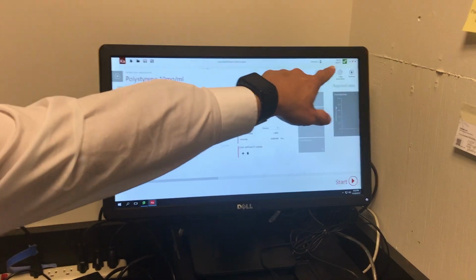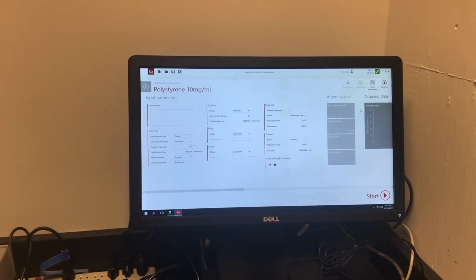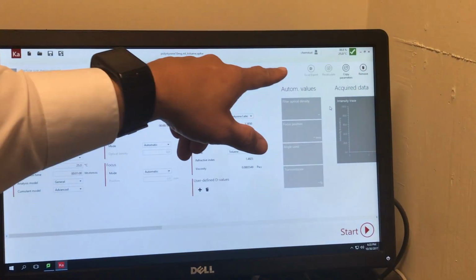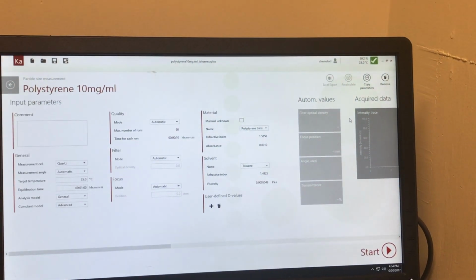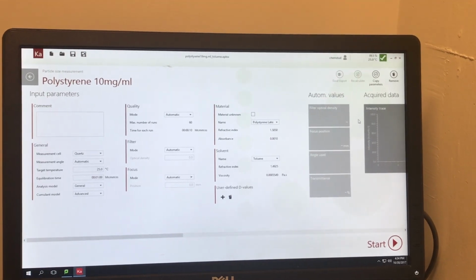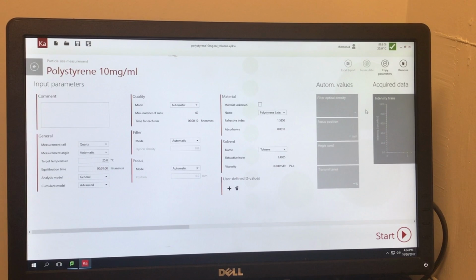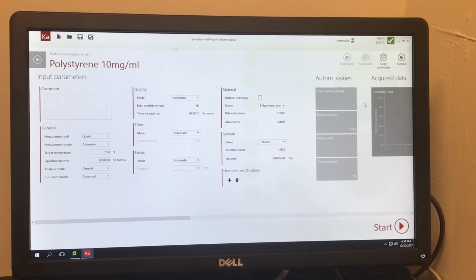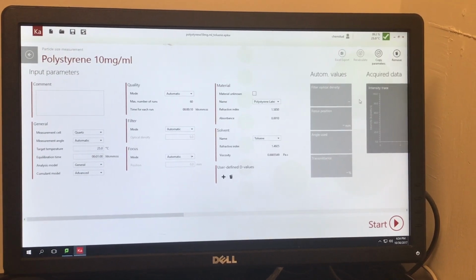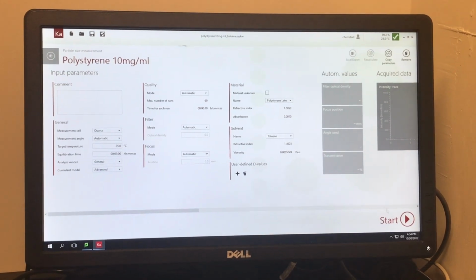You see the transmittance, that's how much laser is going through the cuvette. So that actually tells you how concentrated or how turbid your sample is. So it's almost 89%, 90%. Is that around where you want it to be? No, that's a good value. Good transmittance is somewhere between 5 to 98%, so it's a huge range. This is useful when you're trying to get to a certain dilution consistently. So you can use that value and then press start.